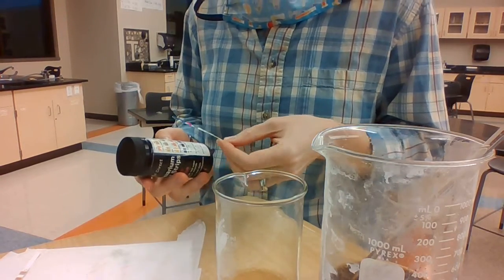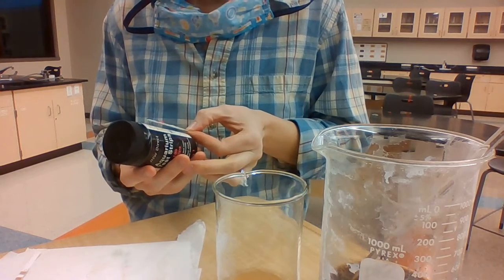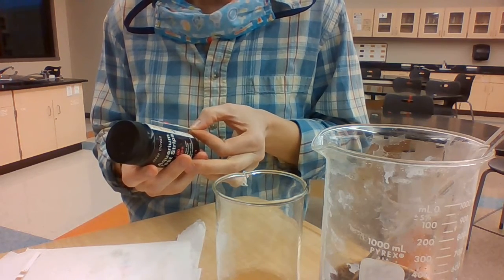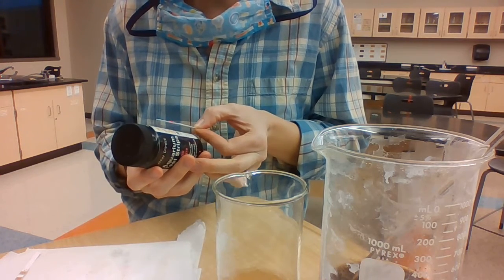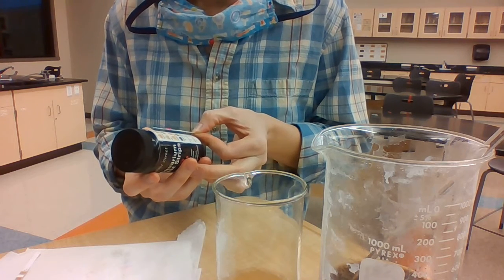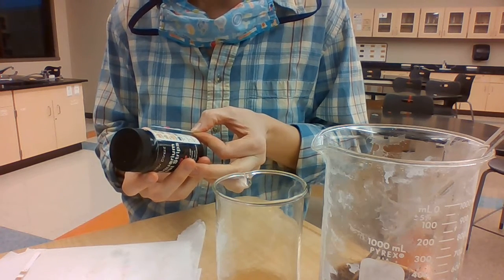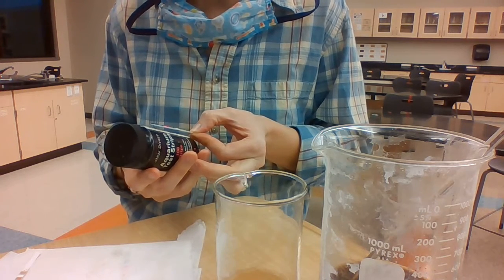Okay, so our second round here, after we have filtered the water, we're going to look at our nitrate. I'm going to say the nitrate is now at 25. The nitrite is a 5. Free chlorine is 0.